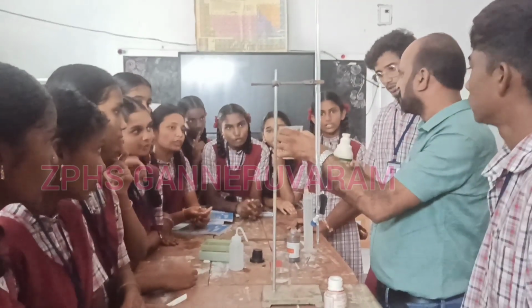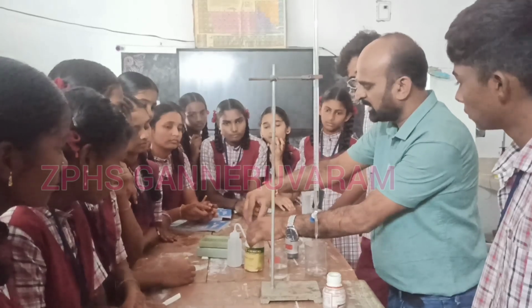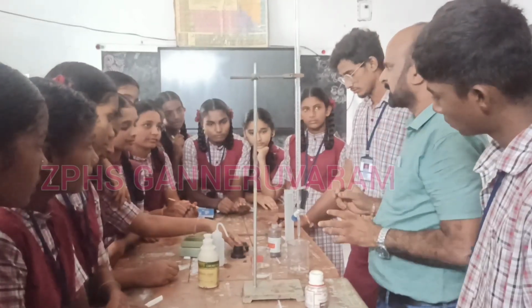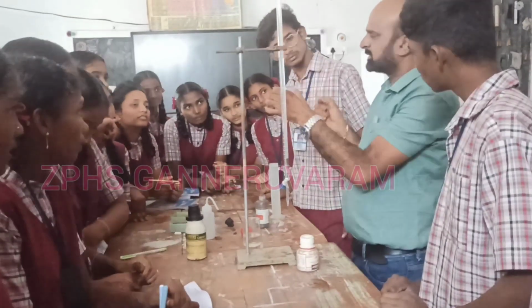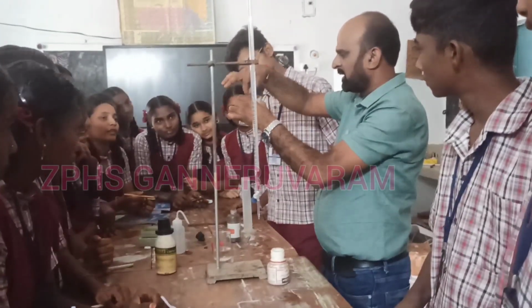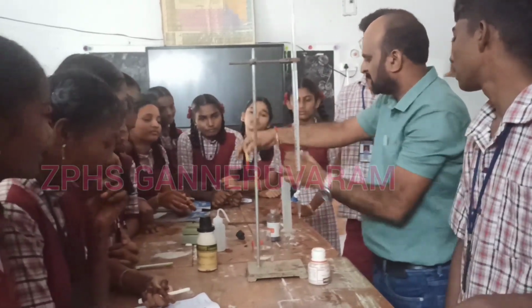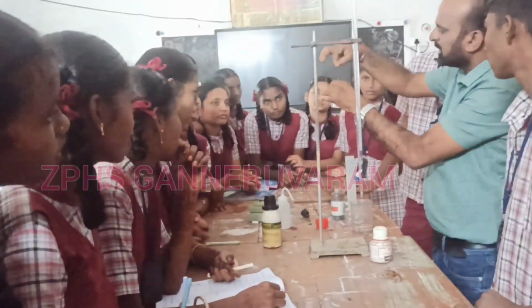Hydrochloric acid solution. Okay, so now we are using the indicators. Again we are going to use the indicator. What indicator do we have to use? We have pH paper. I am using it first. What color have we got? Red color. So that's why it is HCl. It is an acid.